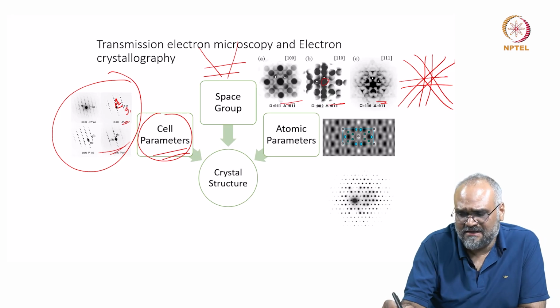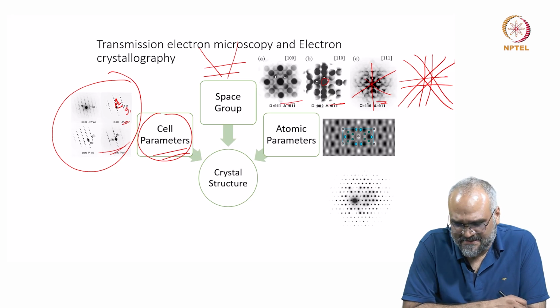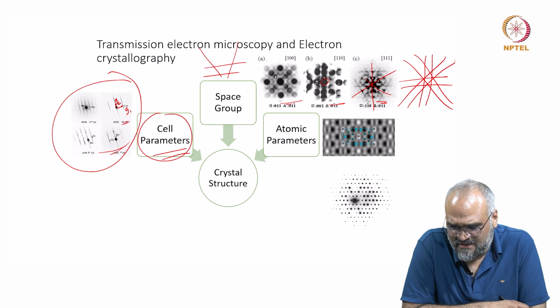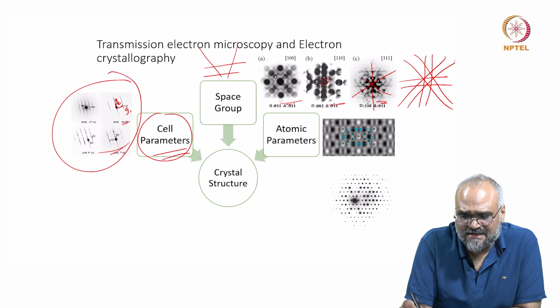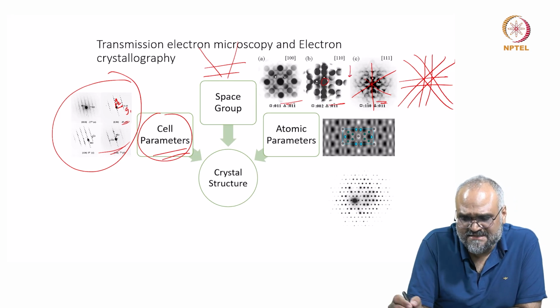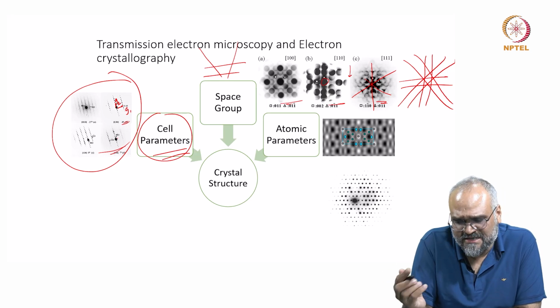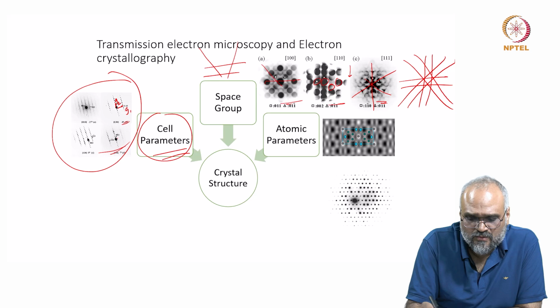As an example, I see a specific kind of symmetry here. I think this is from a crystal of magnesium iridium bromide. I am not sure, I do not remember exactly what kind of a scenario this is, but you can see that from the spot patterns, by intentionally changing the angle of convergence and changing the focus within the specimen as well, I can in fact illuminate in such a way that I get a disk pattern, and I can actually check what kind of symmetry I have, what kind of information I get here.